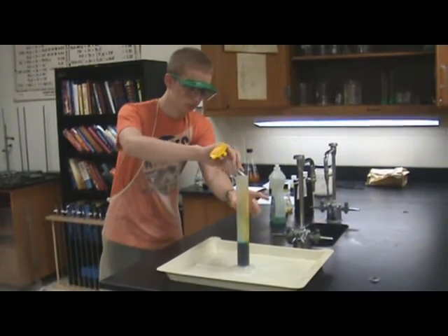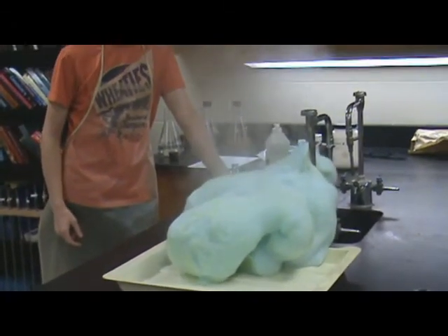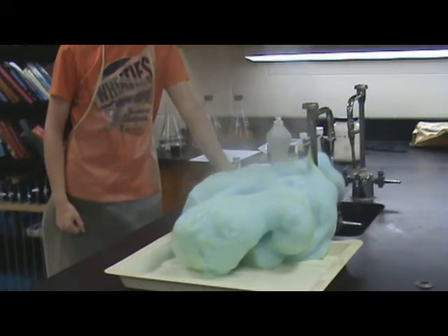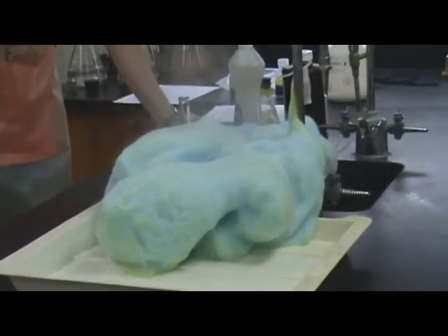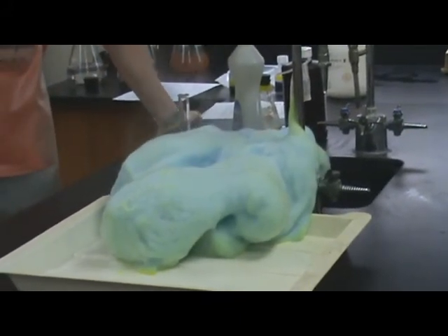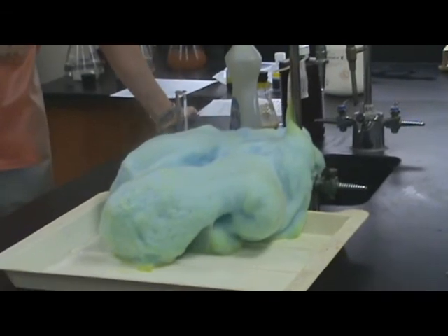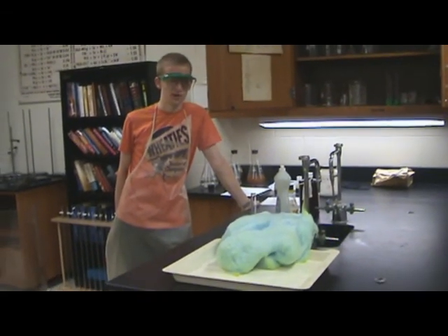So here we go. And it fell over — it's okay. As you can see it's exothermic, and the steam it's giving off is water vapor. The yellow that you see on the outside of the foam is evidence of the catalyst, because the KI is yellow. And the blue is the food color. That's about it.